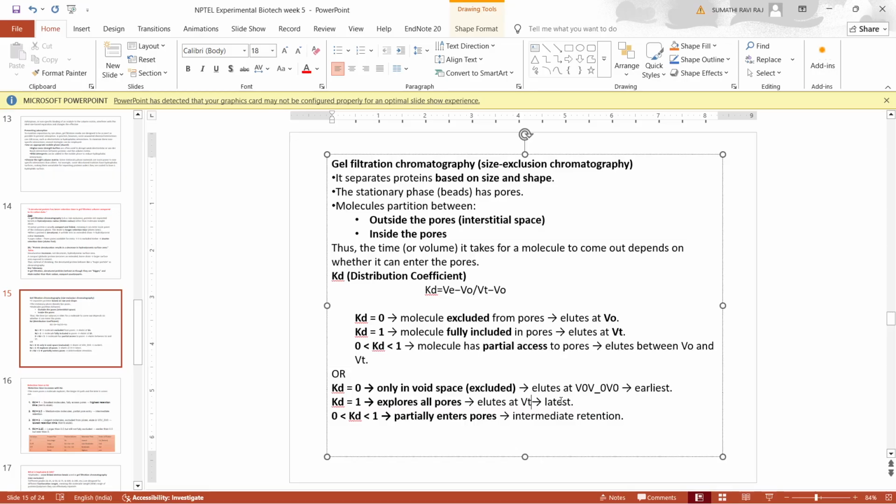So we have to go through a long process to determine whether all the given proteins have come out or not, right, ma'am? Yeah. So basically, now you have it all digitalized. You will get to know in which fraction it is, as your instrument will calculate and tell you. But for the confirmation step, you have to do downstream processing and find out whether you have actually collected your protein or not.